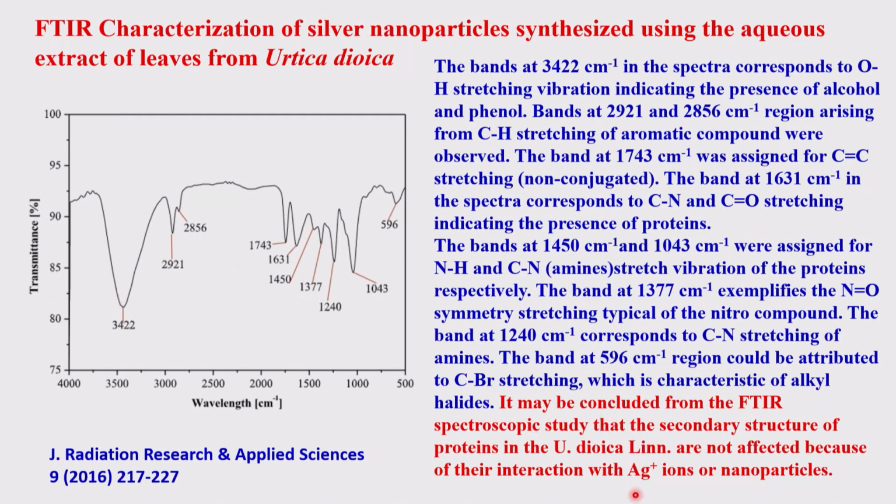So you can see this starting from the entire spectrum. Therefore, what one can conclude from this nanoparticle infrared spectrum is that the protein is still present there. Protein secondary structures are still intact, because that is where your amide bands are coming from.